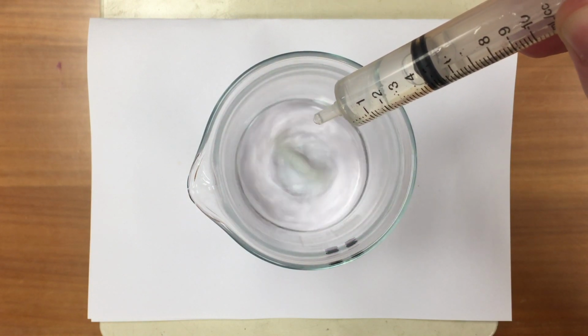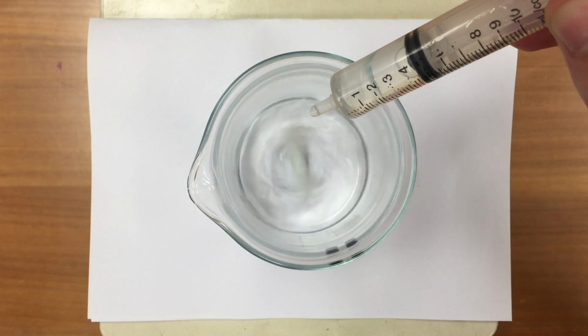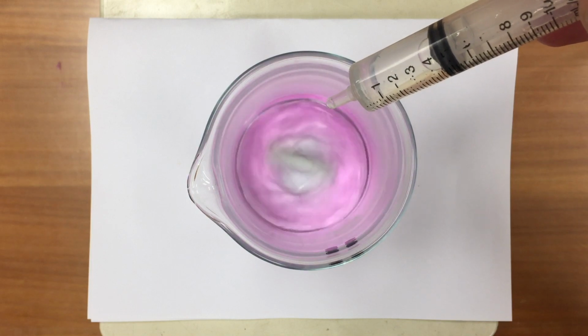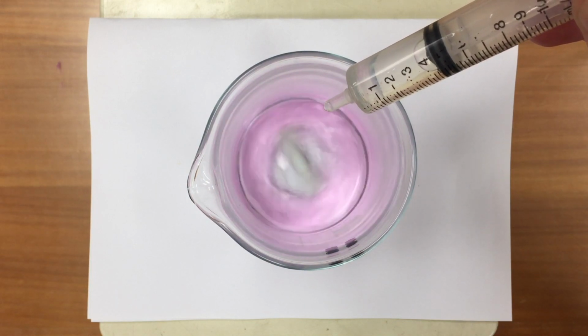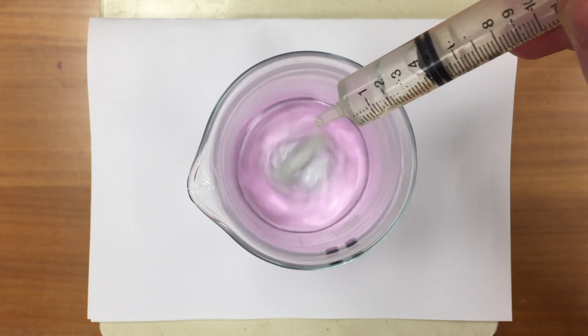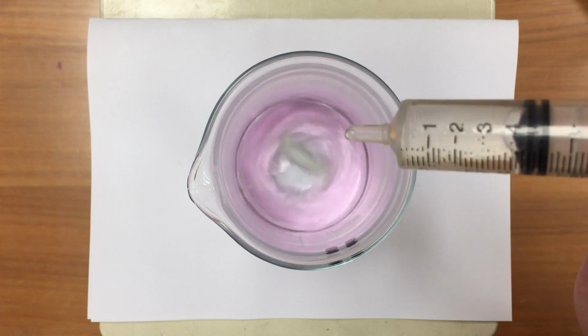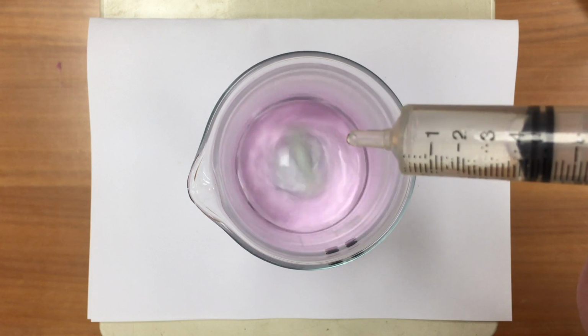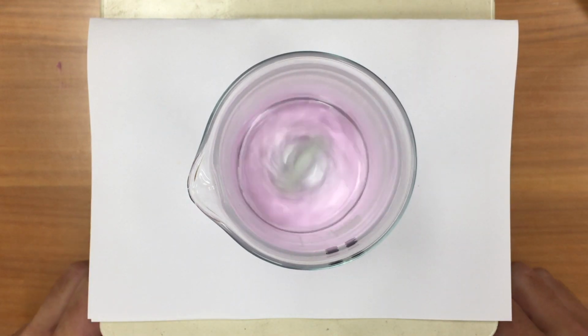Okay, it's there. And as it mixes, it slowly fades out again. Let's go another drop. Okay, that pink colour looks like it's going to hang around. And I've used 15.4 mils of sodium hydroxide to get to that point.